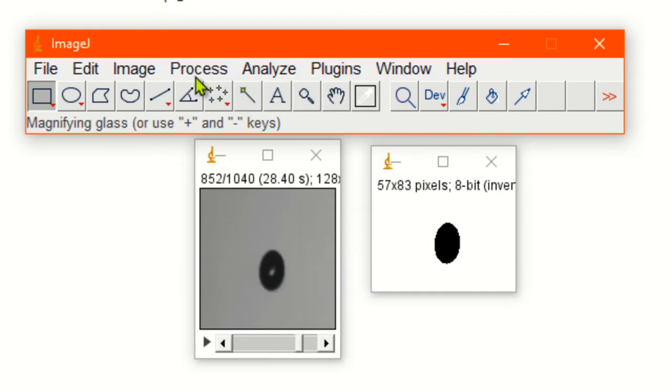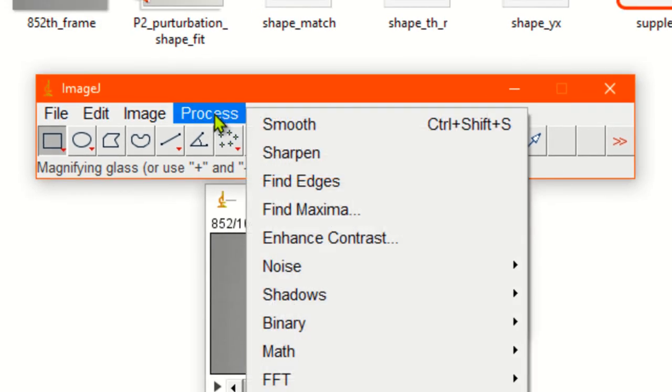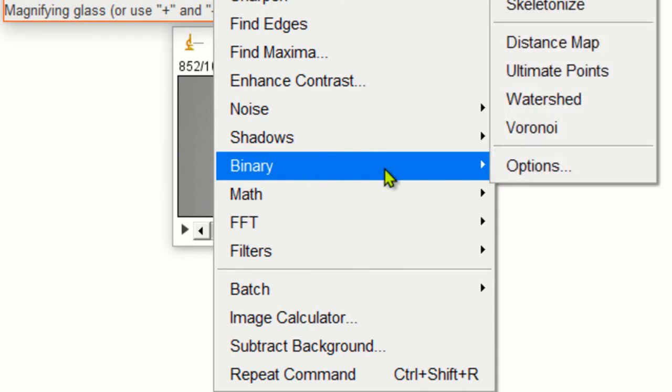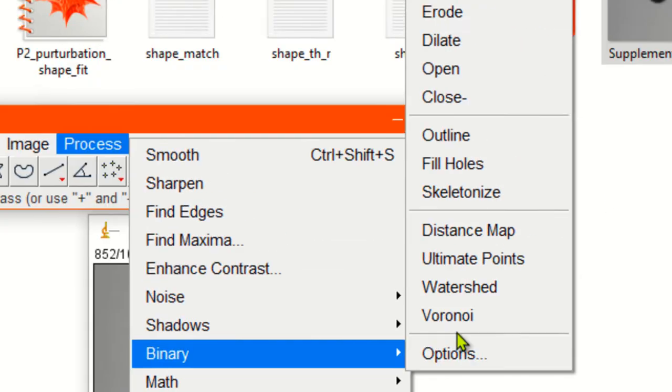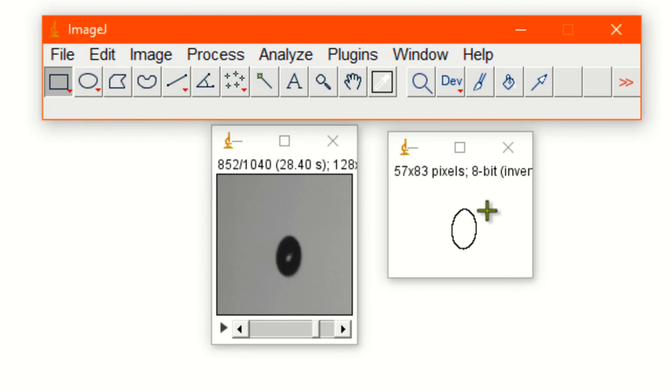We're interested in the boundary or outline of the drop. So simply go to process from the drop-down menu, go to binary, and from here go to outline. Just click on outline. You can get the outline.